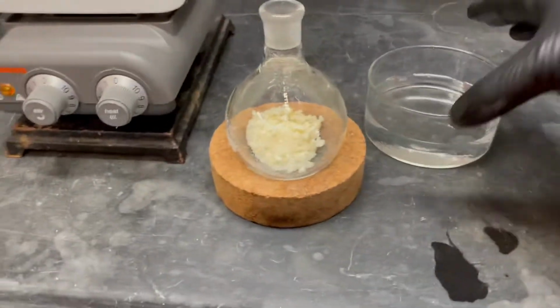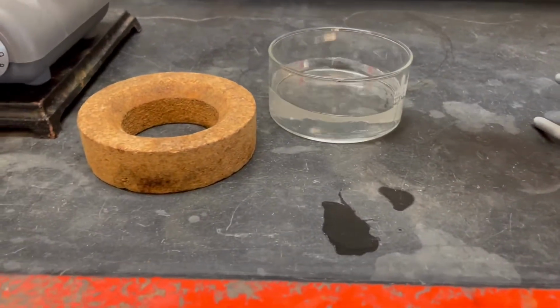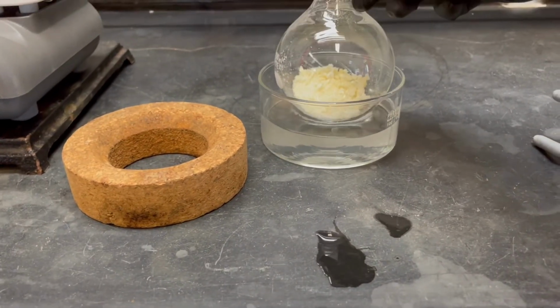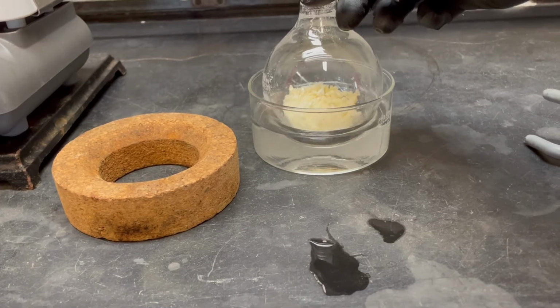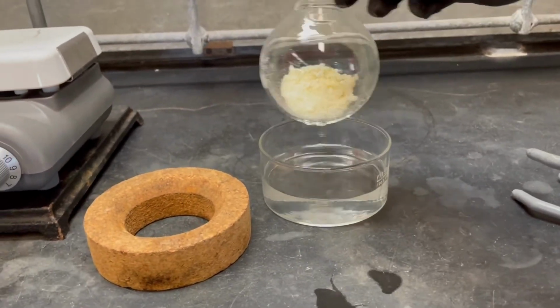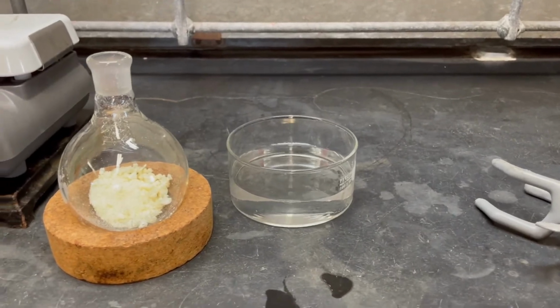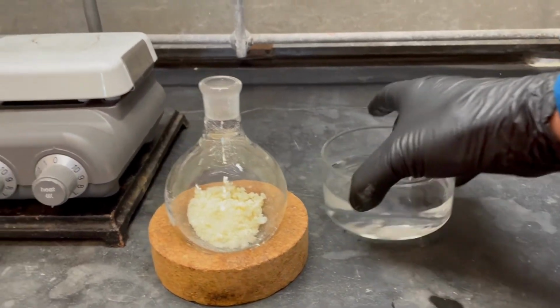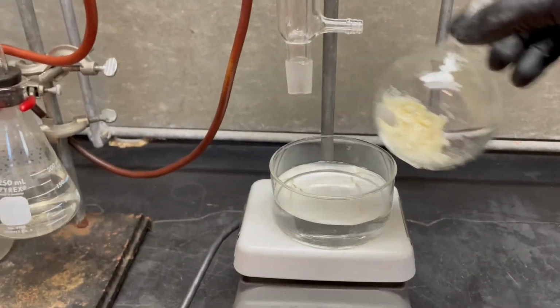Another thing I wanted to point out was we want to make sure that our water level is good. So once I put this big old round bottom in there, you see how that water level rises? Be careful when you set up your water bath, because sometimes it's such a hassle. You filled it up all the way and you got it all warm and toasty, and now you got to add your reaction flask and you're like, oh, pissed.